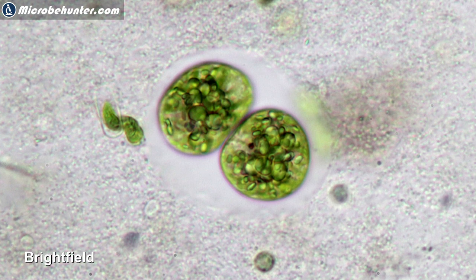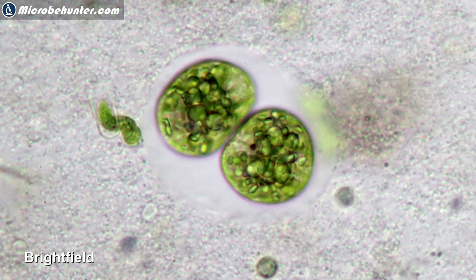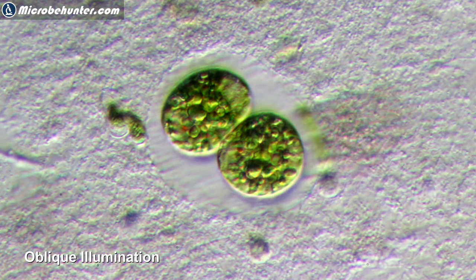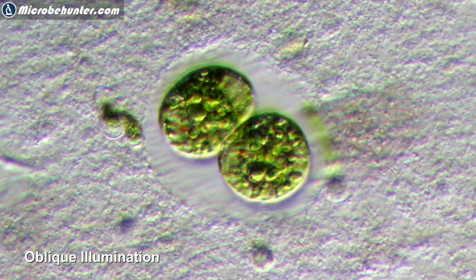I've also tried this with a second specimen. Again, without oblique illumination it's very flat, as we'd normally expect. And then with oblique illumination — look at this — it looks so much nicer.